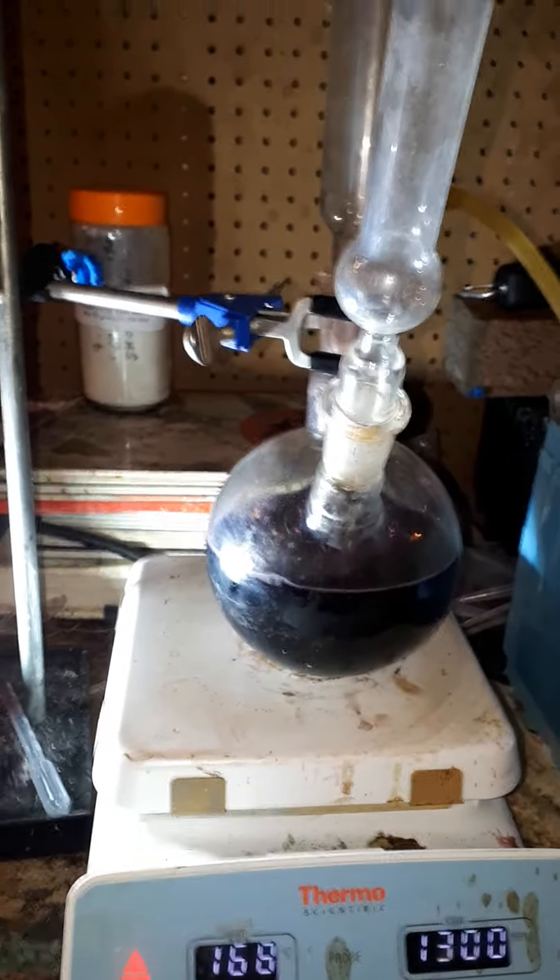No real changes, indicating that there are no tannins or any chemicals that will react with the solution. I am going to remove the hot solution.